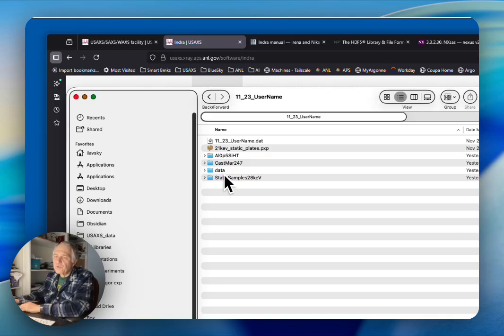And then anytime the user changes a sample to something meaningfully larger, which contains multiple measurements, they can create their own separate folders. So in this case, we had a user who was collecting something which was cast MAR 247 and so on. Now I said we have three different segments of our instrumentation which measures sequentially, and so we also get three different data sets of each sample.